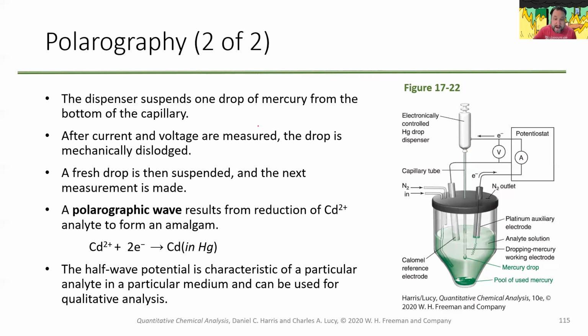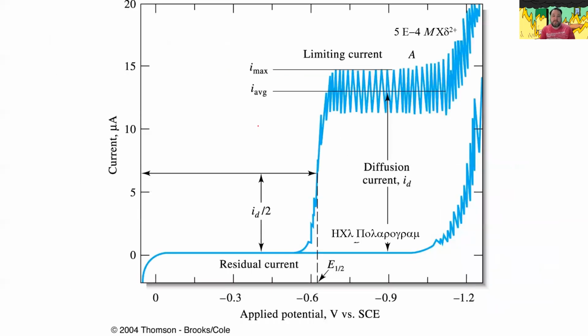So what do I have? This is what one of those polarograms looks like. So we've got a jaggedy looking line, right?